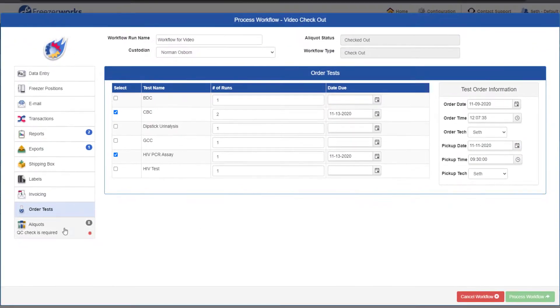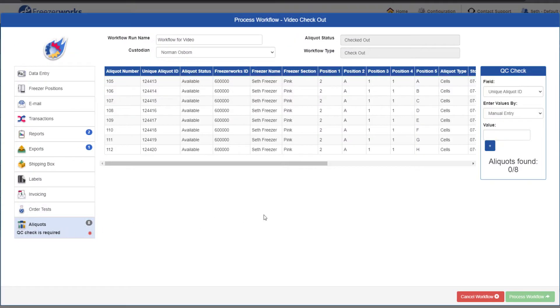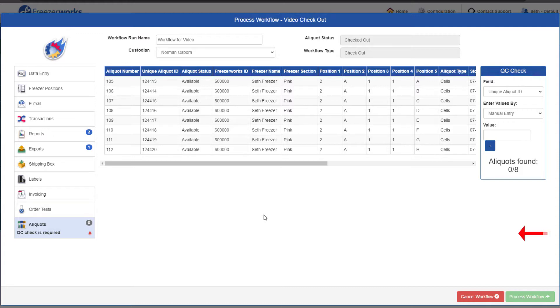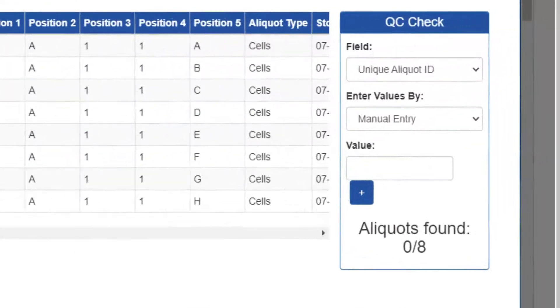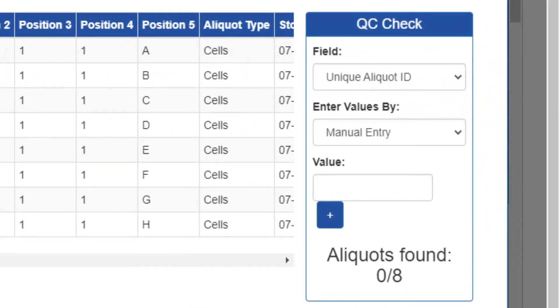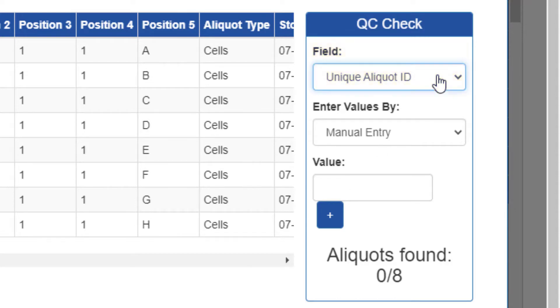The final page in every workflow is the aliquots page, which displays all the aliquots you're running the workflow on. This is also where you'll find the QC check task, if it is required by the workflow, as it is for me. To check the aliquots, go to this box on the right and first make sure that the field is set correctly for you. This is the field you'll be verifying the records with. We'll use the system-generated unique aliquot ID, but feel free to use something else.